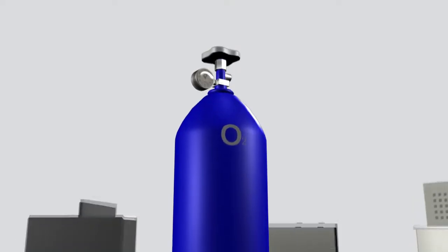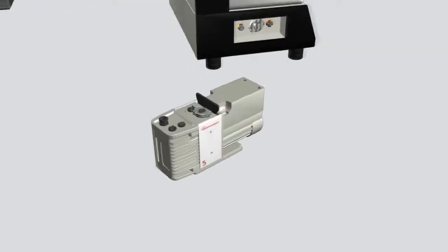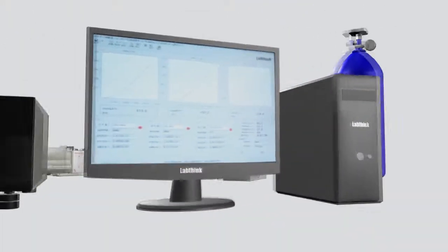The entire system consists of a test gas tank, a temperature control device, a vacuum pump, the GRT tester, a computer, and the testing software.